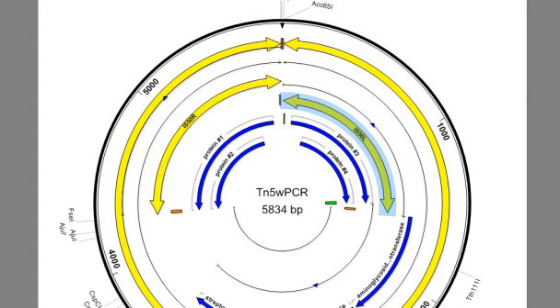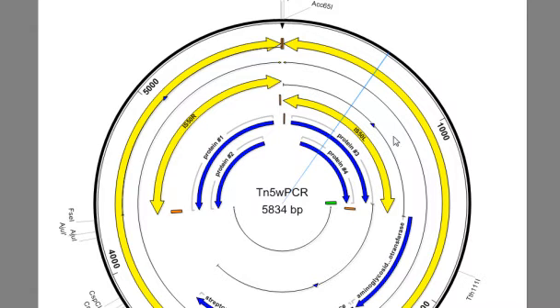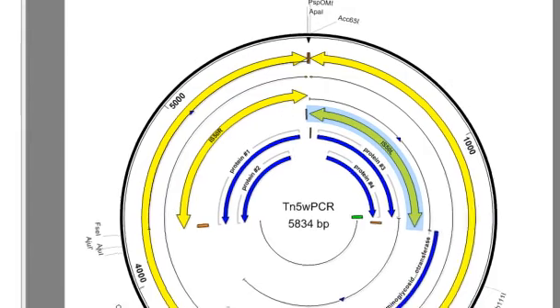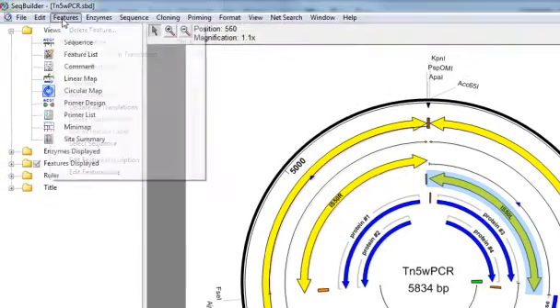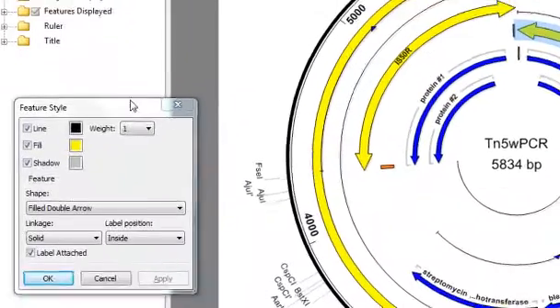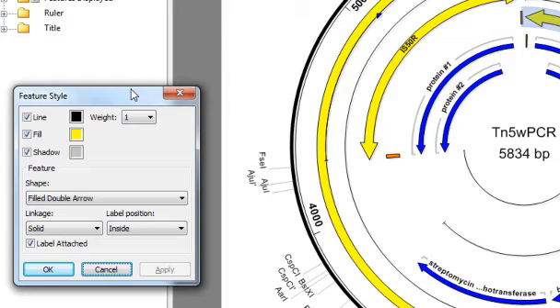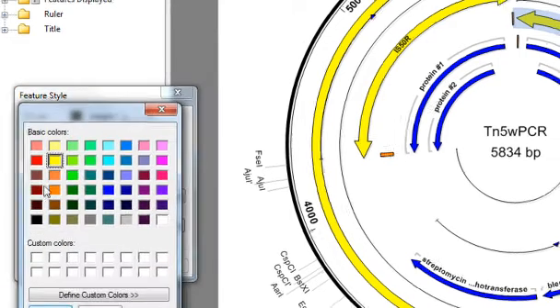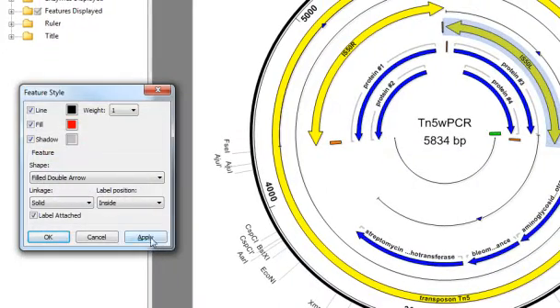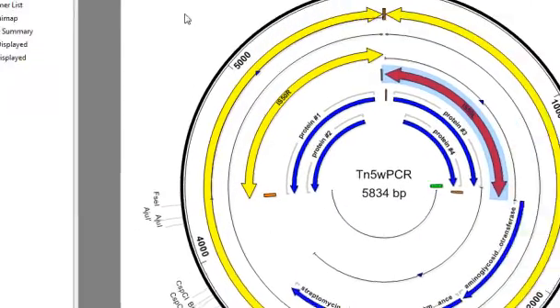If you want to change the color or style of a feature, you can do that just as you would in any view by selecting the feature, and then selecting Features, Edit Feature Style, and from here you can change the weight, color, and shape of the feature. For example, I'll change this Repeat Region feature so that it now shows up in red instead of yellow.